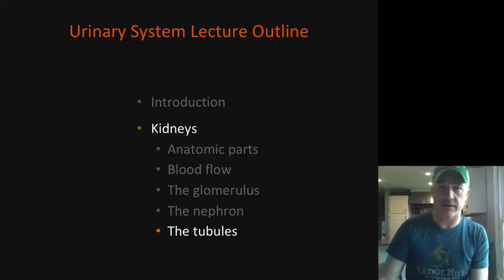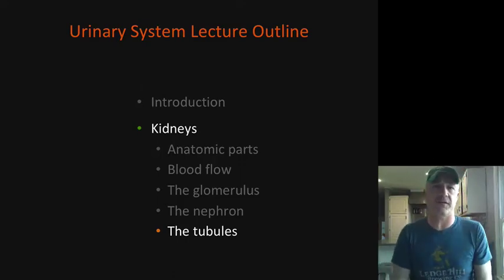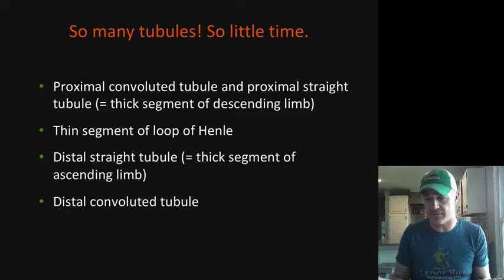All right, histology. So we're going to work on doing a little bit more with the different kidney tubules. You're going to learn to differentiate some of the different parts of the nephron on this one. Then we'll go to a slide of the kidneys and take a look at each of those. Again, these tubules are part of the overall nephron.